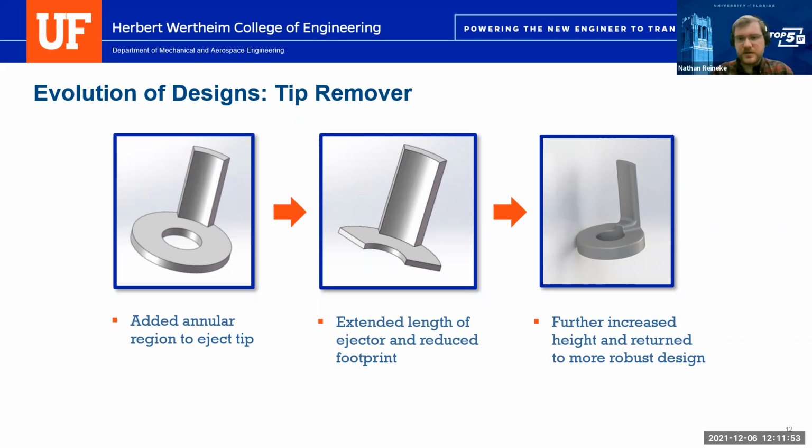This eventually changed because we realized another way of adding the tip receiver tube to the housing, changing the tip remover. This led us to make a more robust model, as well as making it fully circular. We also added fillets, so then there was no stress concentration. But of course, we still did FEA analysis to make sure that wasn't an issue later on.